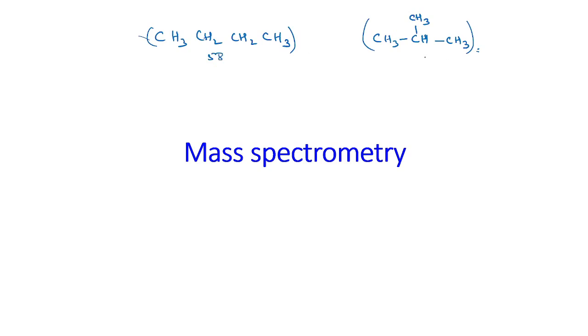This is 58. So in both the cases at 58 you will be getting a peak for the molecular ion.